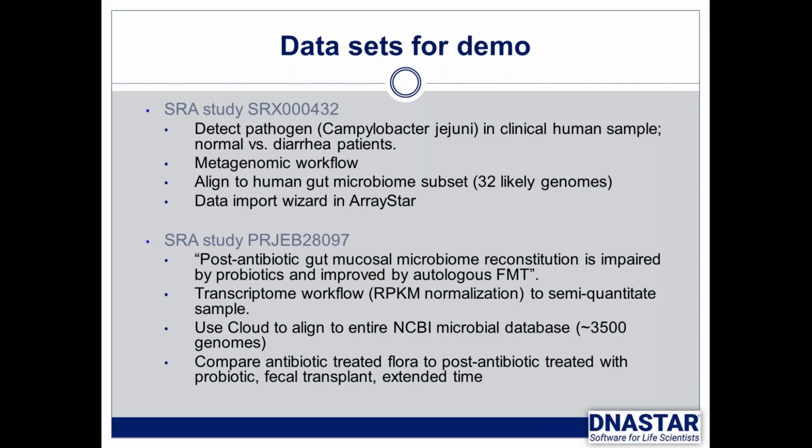So of course, when people take strong antibiotics in particular, it can really clean the gut out and cause all sorts of issues. So it may be probiotics, or a fecal transplant, FMT, or just time. Give it a few months, and you can look at the metagenome changes. And I just pulled a few samples kind of randomly out of this really large study. There are all sorts of other controls in different regions of the gut, and I just pulled a small subset so we could look at that for today's webinar.